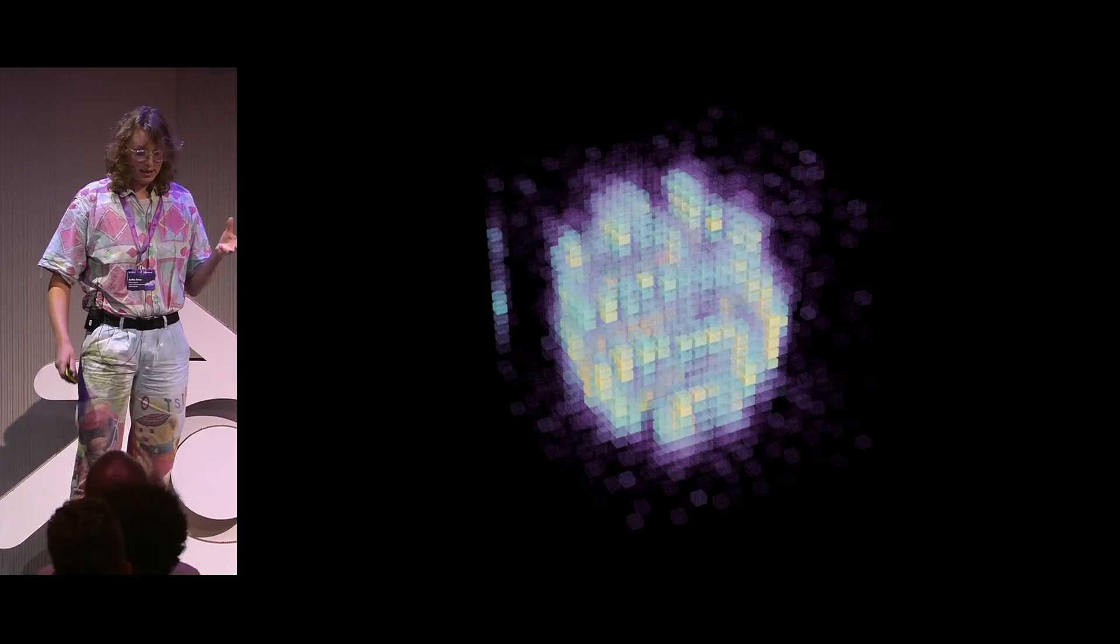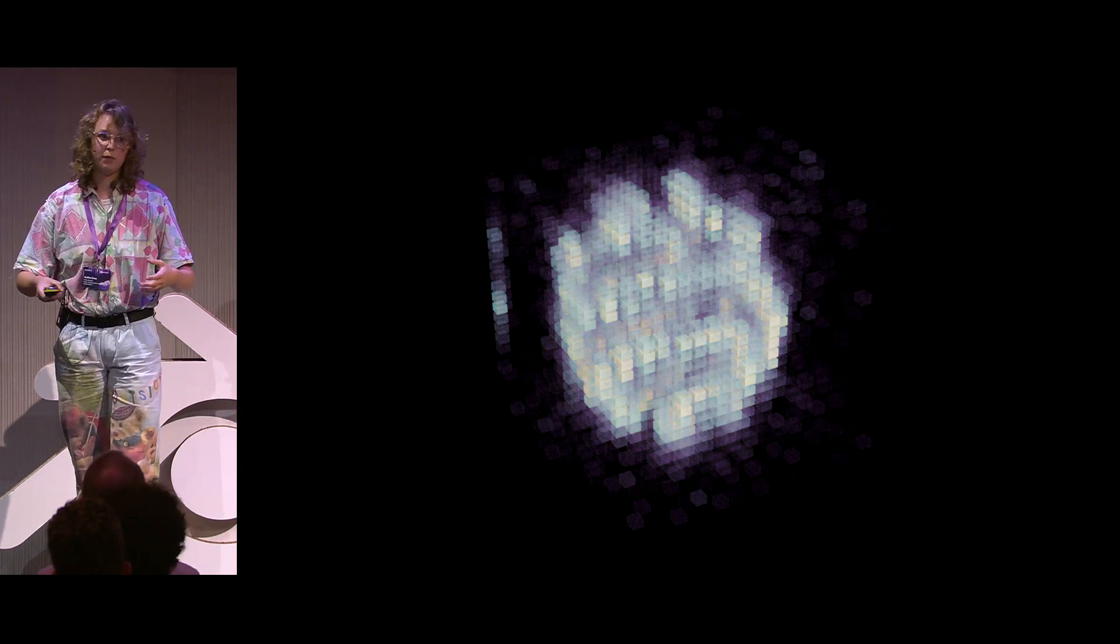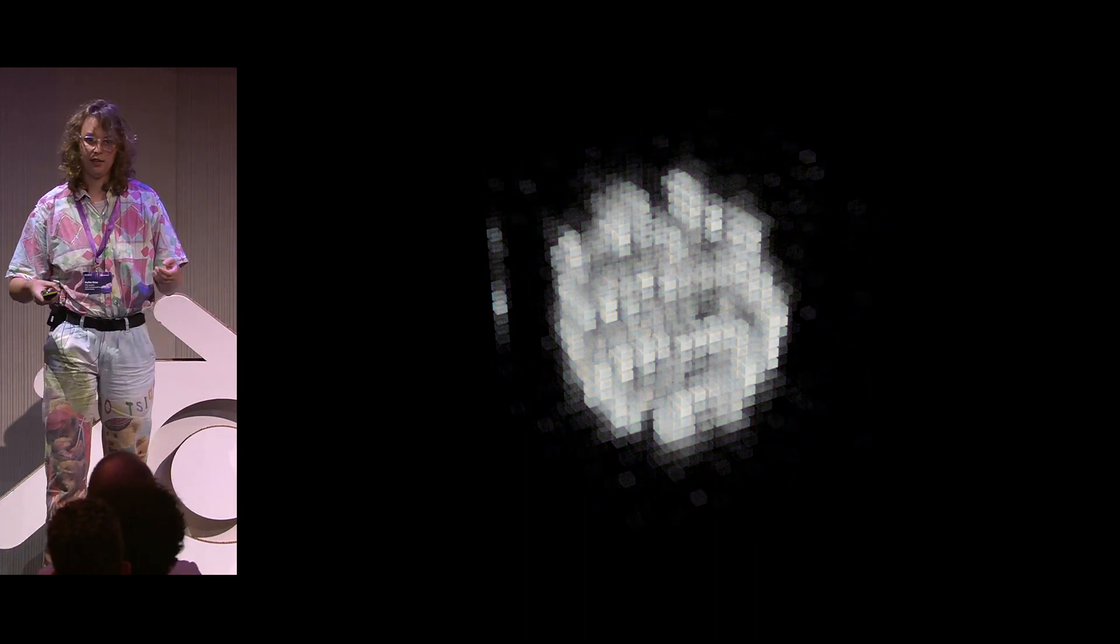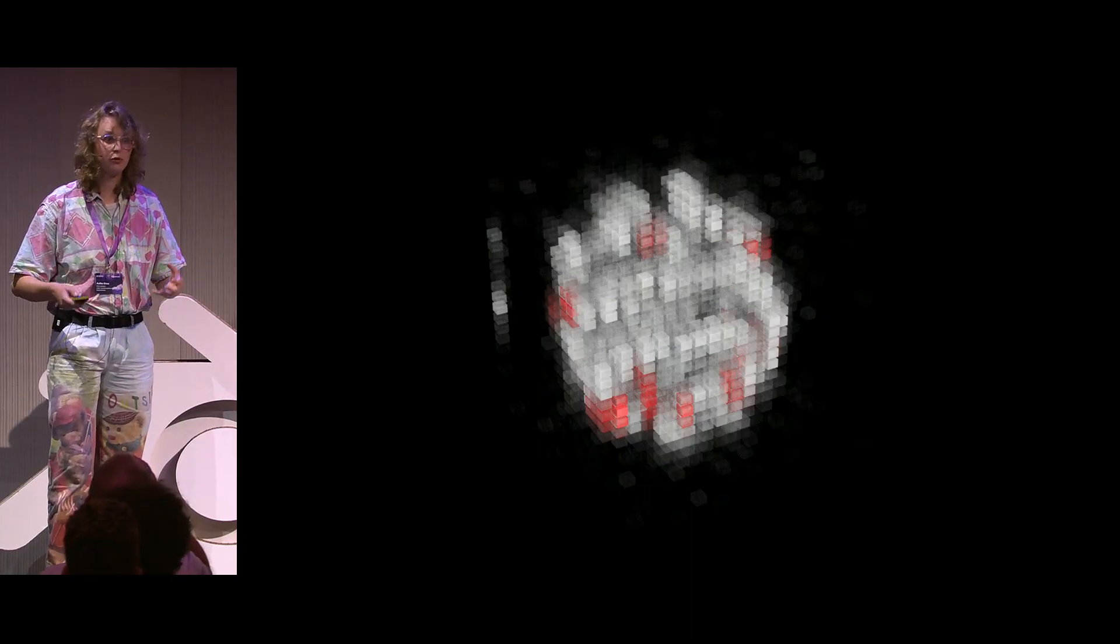But not all of our data is actually monochromatic. Some of our data does have multiple channels in the same way that we have RGB channels in natural images. But in contrast to RGB, these don't have predefined ways of interpreting the channel. So here we have, for example, in red, a fully different measurement, which is a protein that assembles onto the chromosomes, that we, as a visualizer, can visualize in multiple different ways and really need to make that choice when we're visualizing it.